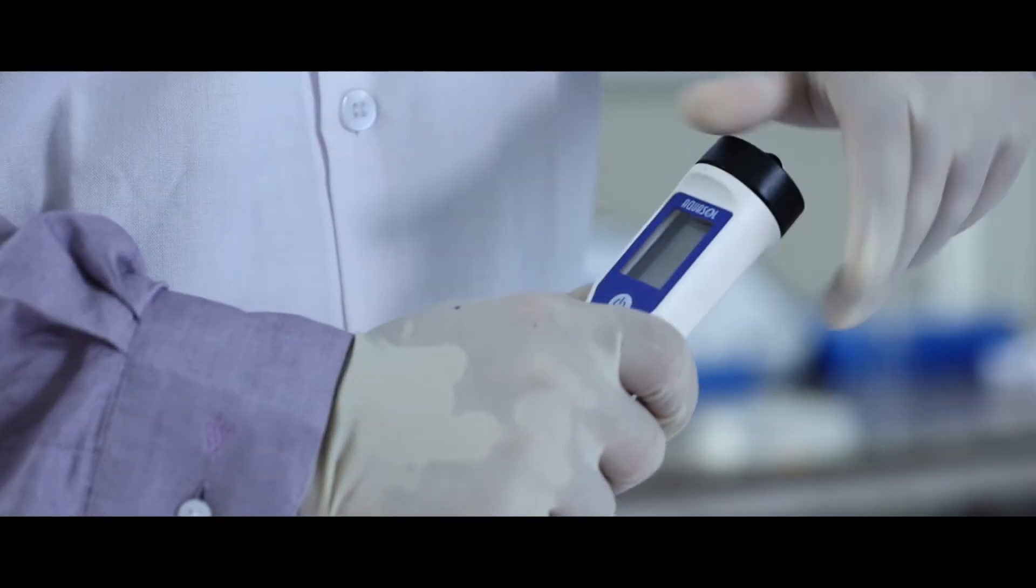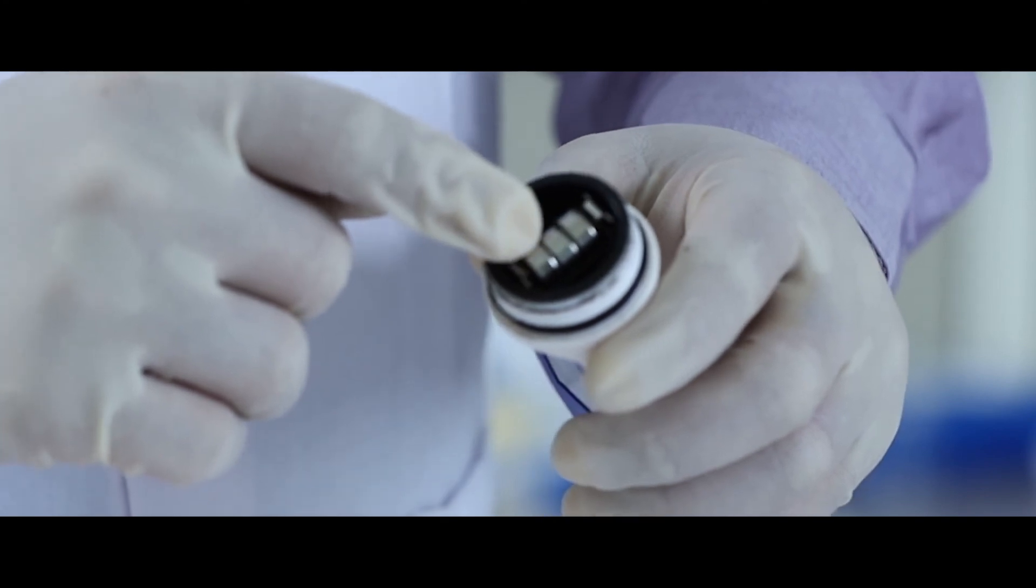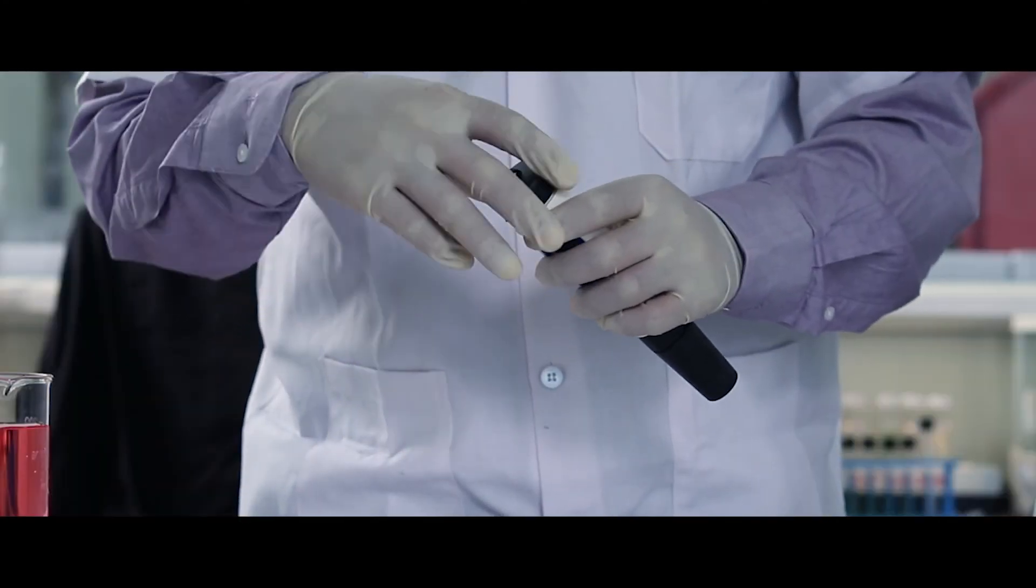To change the batteries, unscrew the battery compartment on the top. Note the polarities and replace the batteries. And screw the battery cap back.